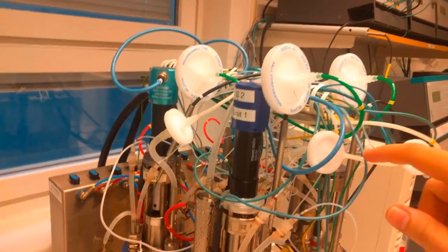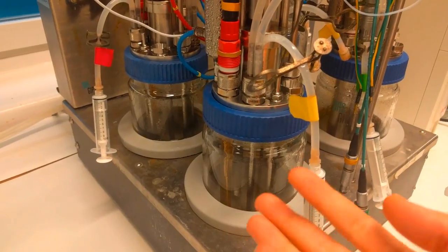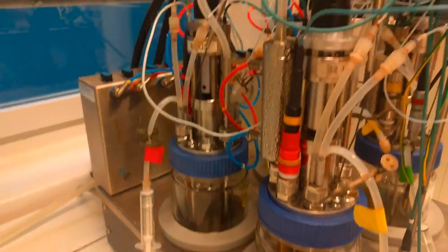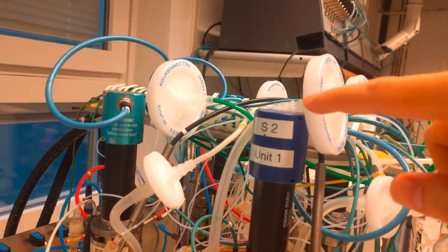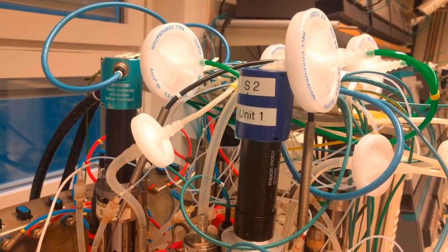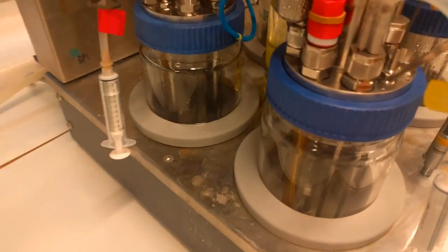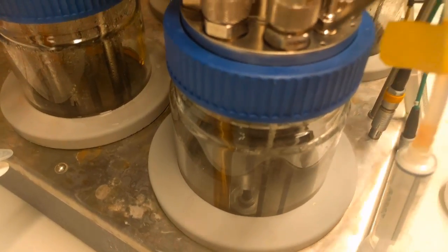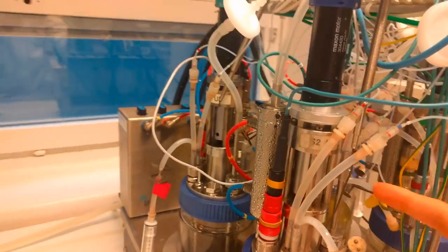The next thing to look at is where the air goes in - that's through this white tube. It goes through a little filter and down through our sparger as we talked about before, which is released below the surface of the liquid and as you can see from my fingers, bubbles up. That air is going to come out of the fermenter through this tube down this green line. It's going to go through another filter to make sure we don't spit out any moisture and then it's going to be analyzed in a gas analyzer. Next, you see a motor and an impeller spinning below the level of the liquid.